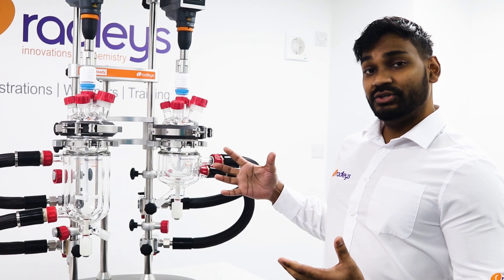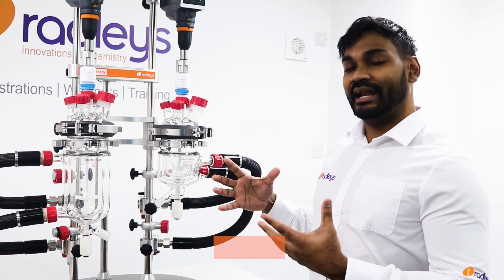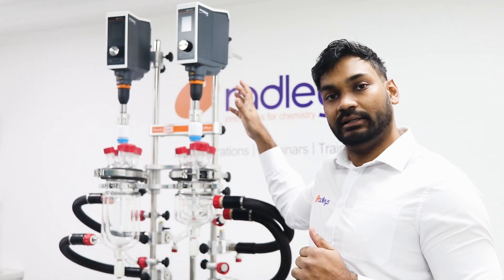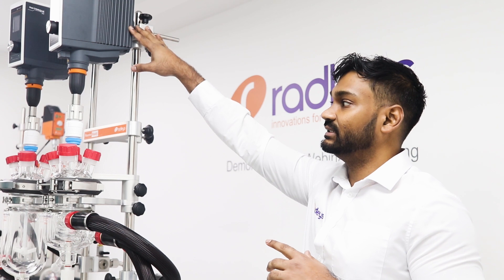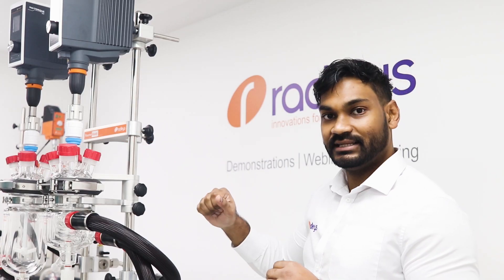The robust heavy duty framework features three stainless steel support rods which add extra cross bracing to the system. The system accepts two overhead stirrers which can be operated independently of one another, both of which are supported to minimize transfer of weight from the overhead stirrer through to the lid of the vessel to reduce the risk of glass breakages.